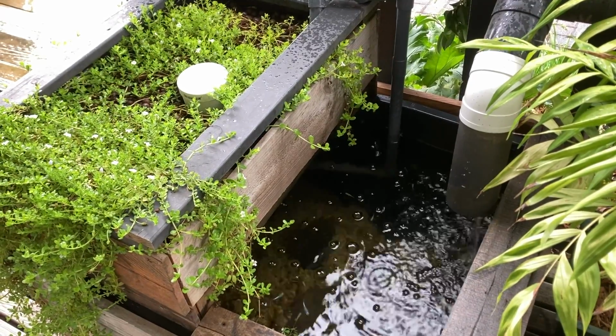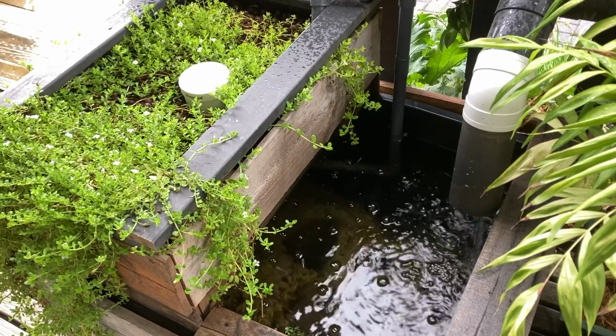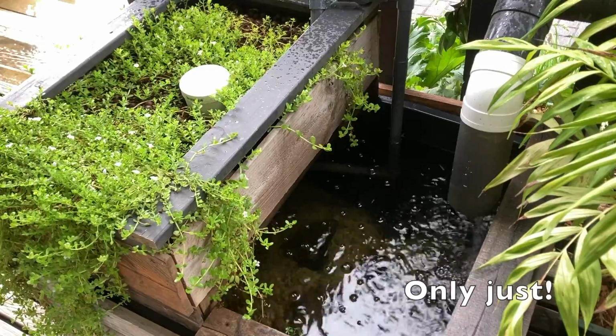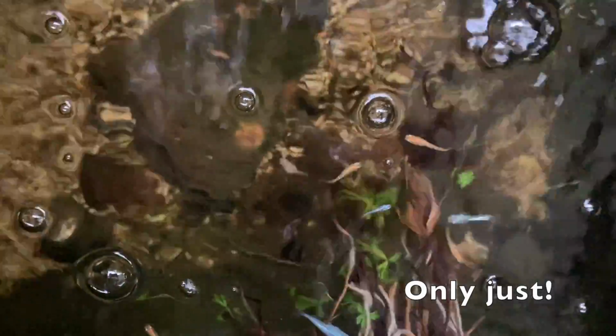Even though the ORP was lower, it still falls in an acceptable range according to the manual that came with the unit. Same with the TDS. So I have a theory on why this pond is different to the last one. Both ponds have well-sized bulk filters, but that's where the similarities stop. I talk about it all the time, how I'm a low-maintenance kind of guy, so water changes, well, that's not really going to happen for me.